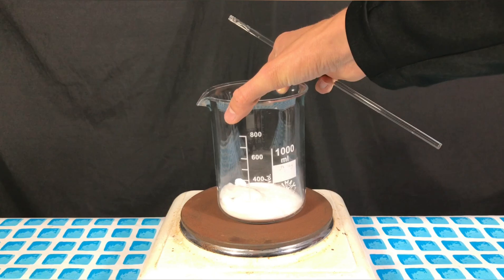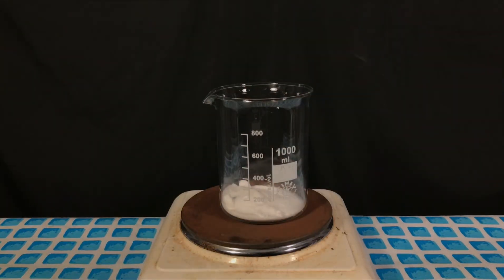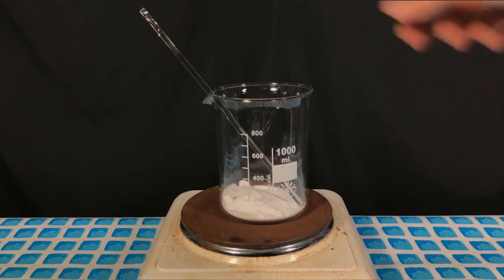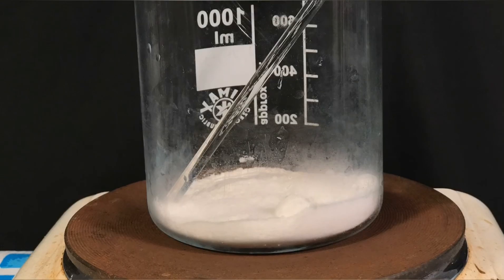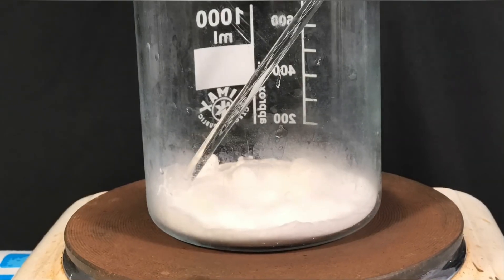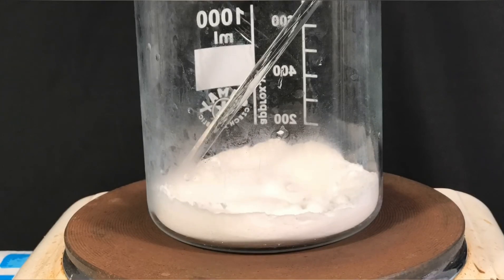To turn sodium bicarbonate into sodium carbonate a hot plate will be needed. A Bunsen burner or even an oven can also be used. It is important that the heat source used can reach approximately 200 degrees Celsius.